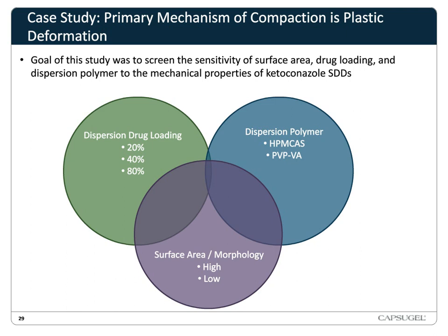The results indicated that the mechanical properties are dependent on drug loading, dispersion polymer, and surface area, but in a very different way than the previous case studies. Although they exhibit really favorable mechanical properties, they're generally not as tunable as the SDDs in the previous case studies that exhibited brittle fracture.